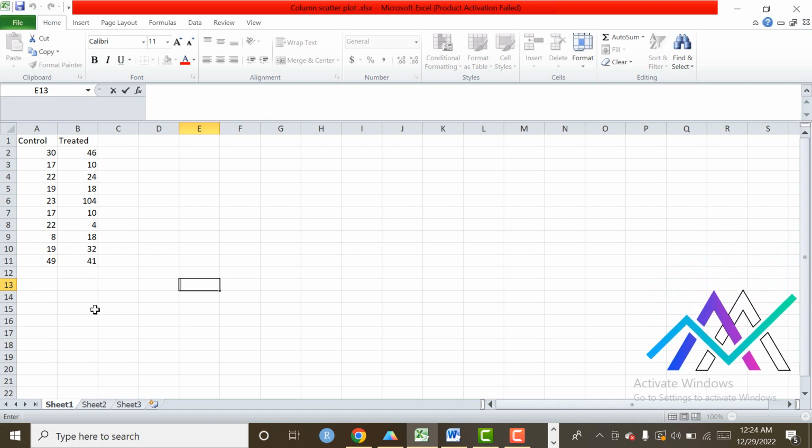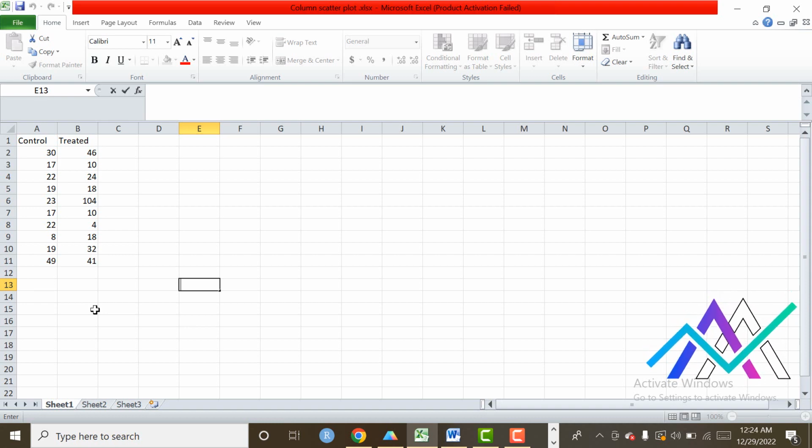First of all, I will export data from Excel to GraphPad Prism. In a previous video, I have already told you how to export data from Excel to GraphPad Prism. I will provide the link on screen. So let's have fun with graphs.